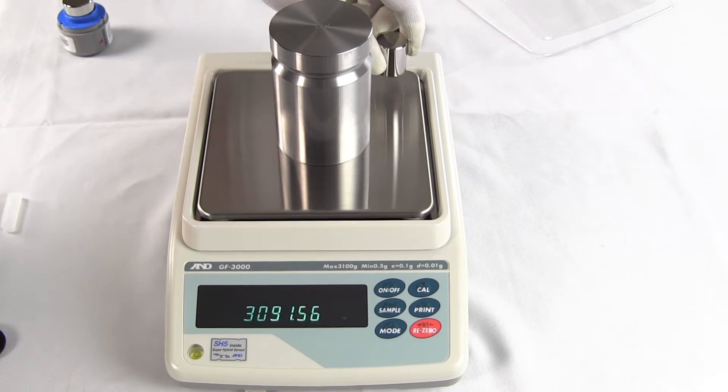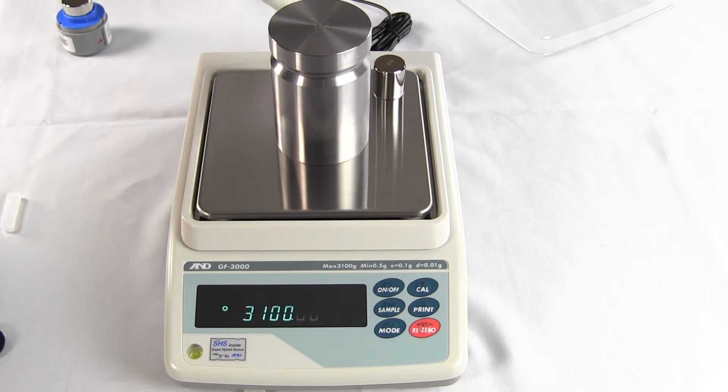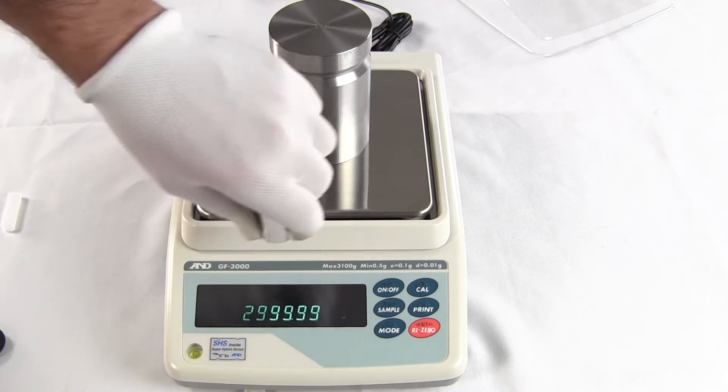We'll put the weight in all four corners of the platform. You can see it performs extremely well.